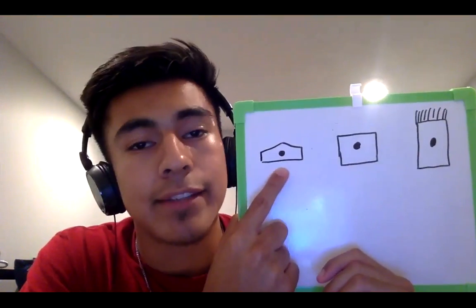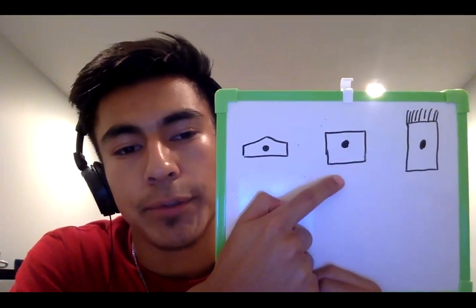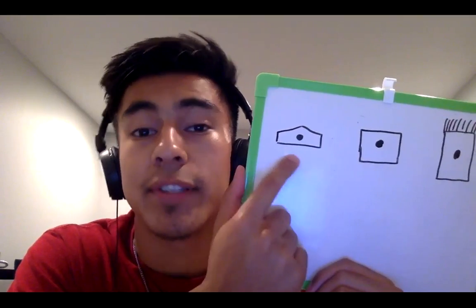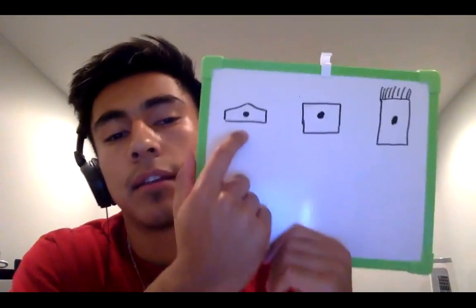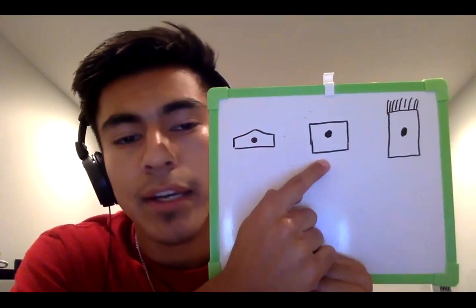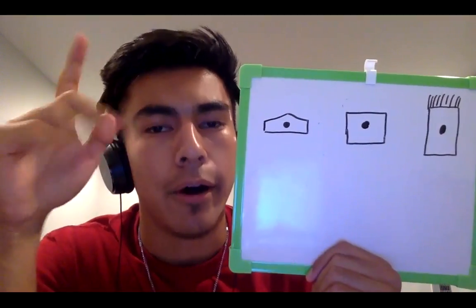The way I remember is I say squished. It looks like this squamous cell was once a cuboidal. However, someone sat on it, and now you have a tiny squished cell for epithelium. Next, we have a cuboidal. It's supposed to be shaped like a cube in textbooks. Generally speaking, these are very well-rounded and evenly shaped all around.